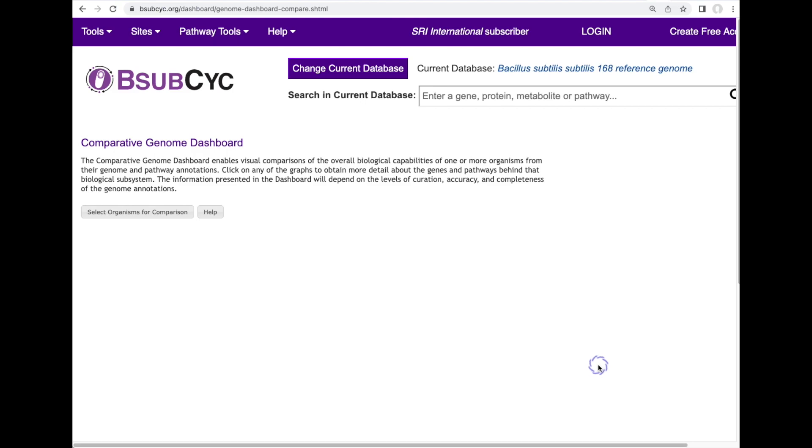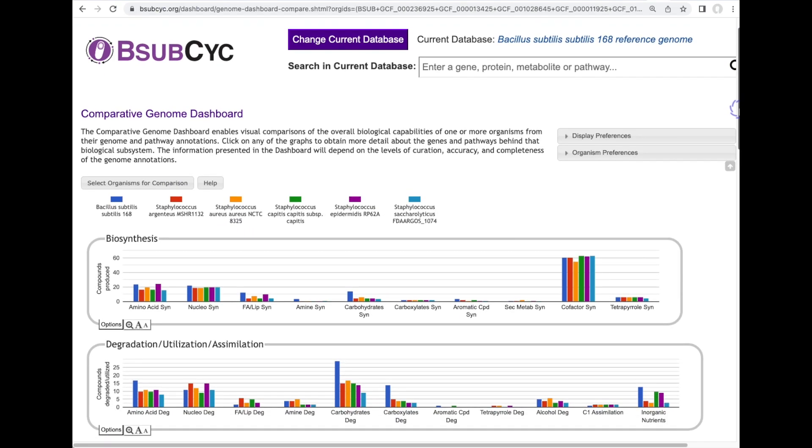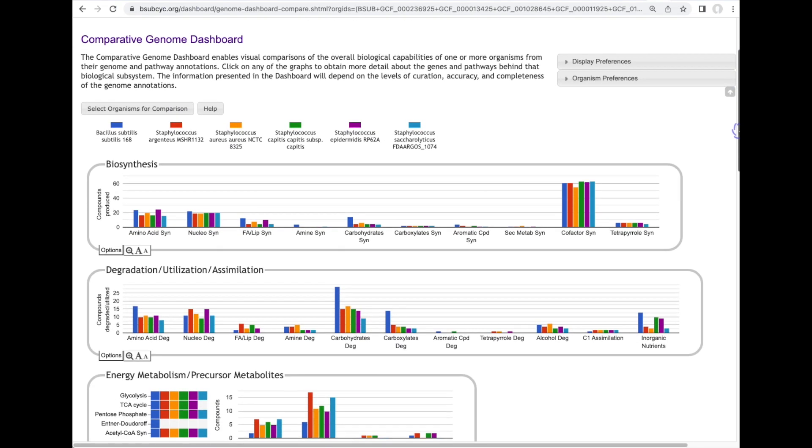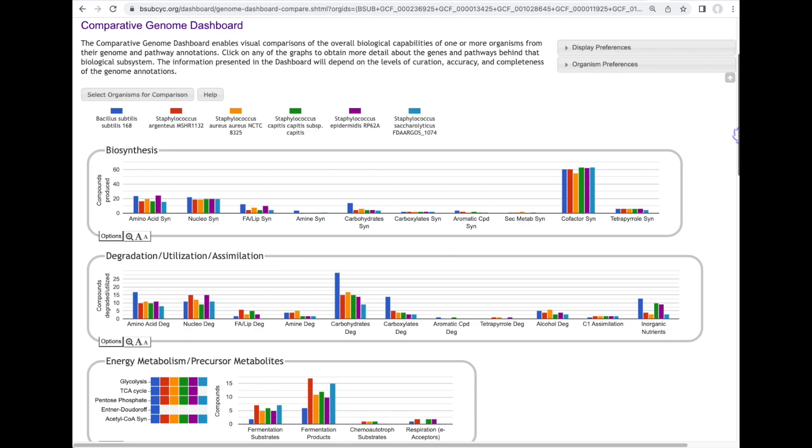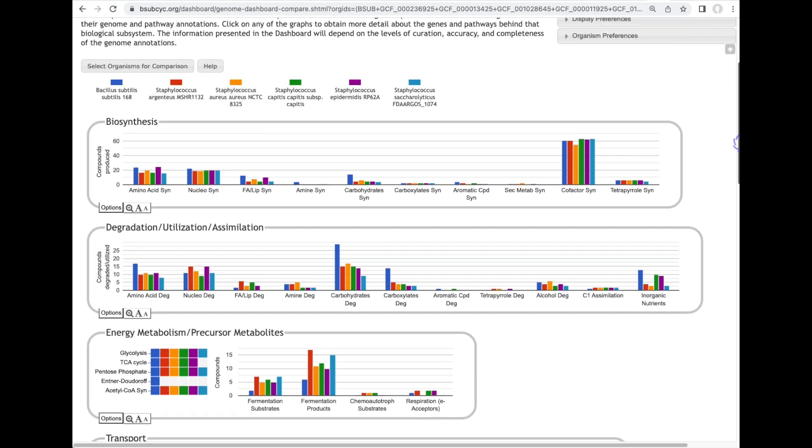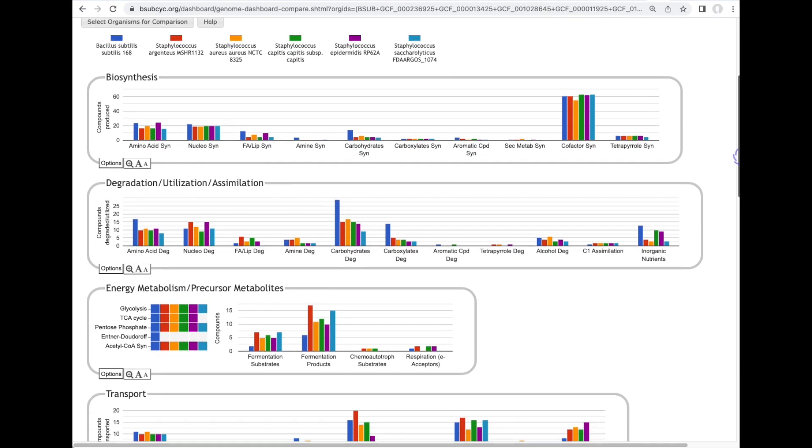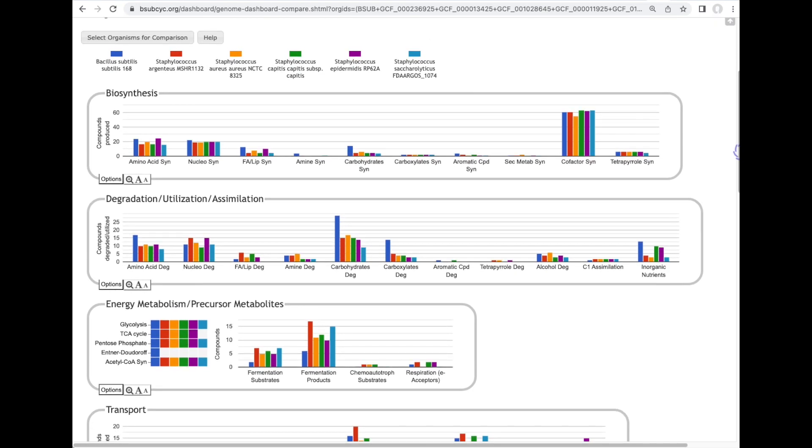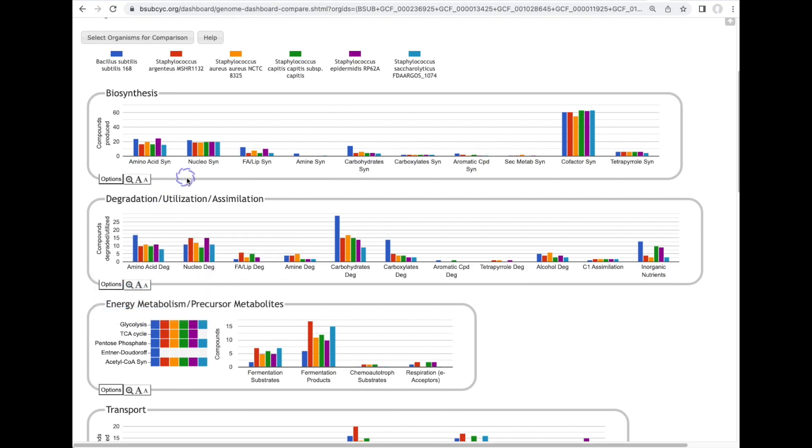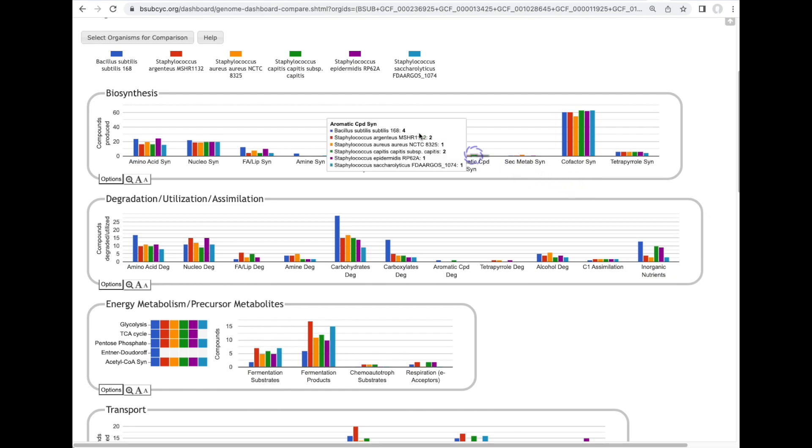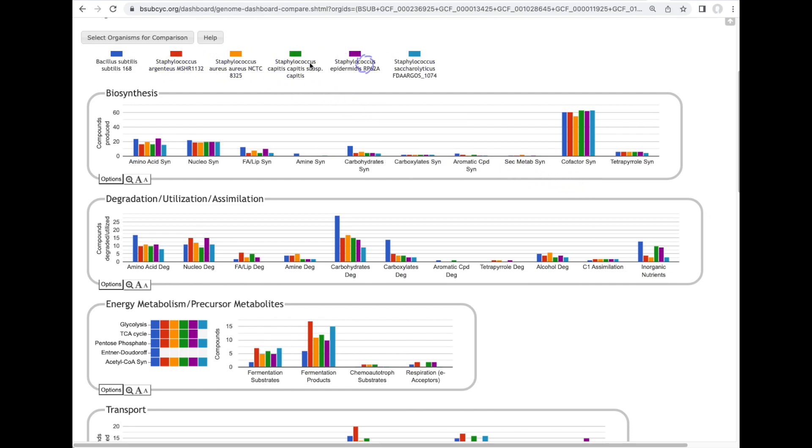BioCyc has multiple comparative tools. This tool called the comparative genome dashboard lets us compare a number of genomes from a functional point of view. Like the genome dashboard this diagram is divided up into multiple different panels but here we're actually comparing the functional complements of these different organisms shown at the top here.